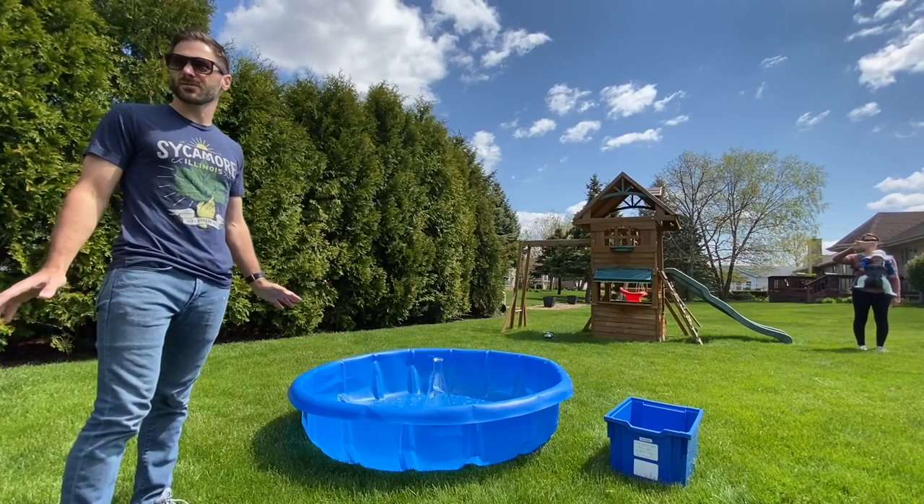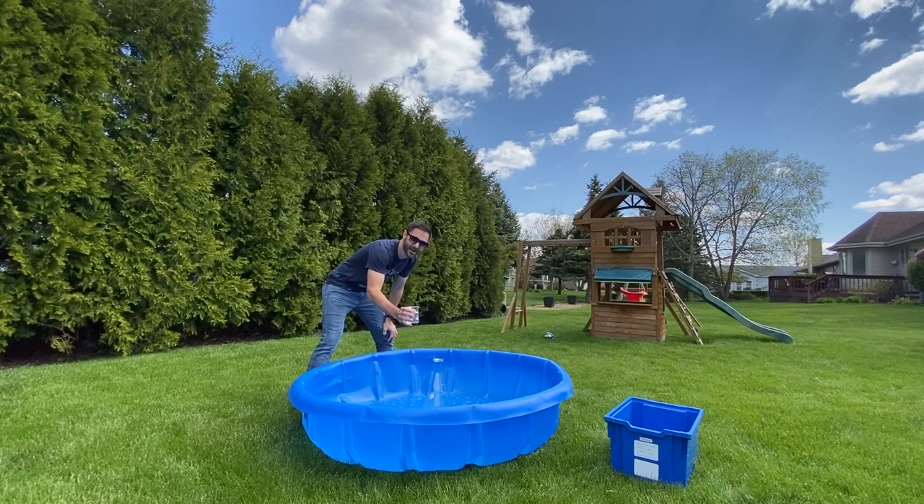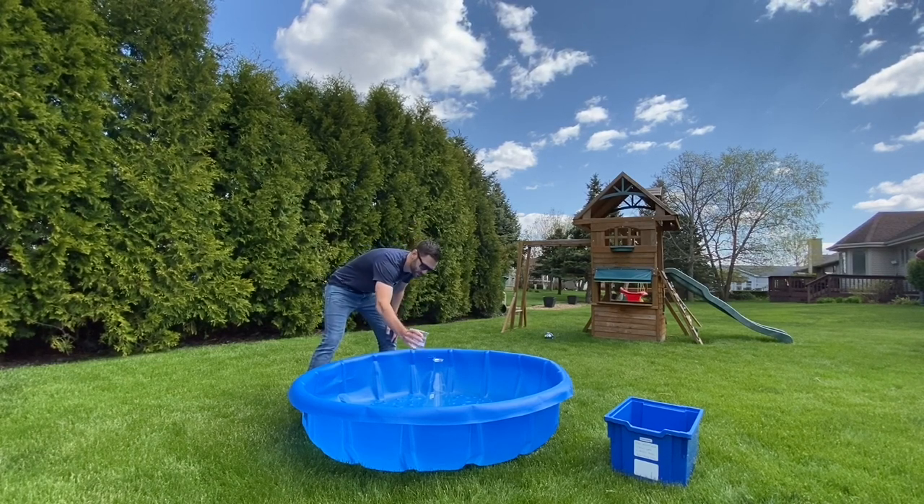Have you guys ever heard of elephant toothpaste before? Let's try this. Ready everybody, count it down. Five, four, three, two, one.